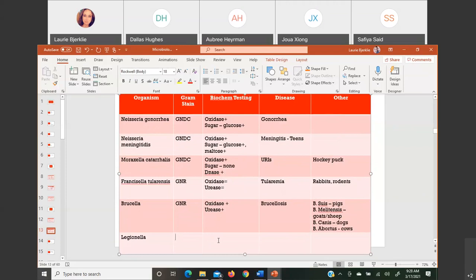So you should be under a category hood 3 with Francisella and Brucella and Legionella. Most hospital labs have just a level 2. You need a level 3 hood if you think you have one of these.